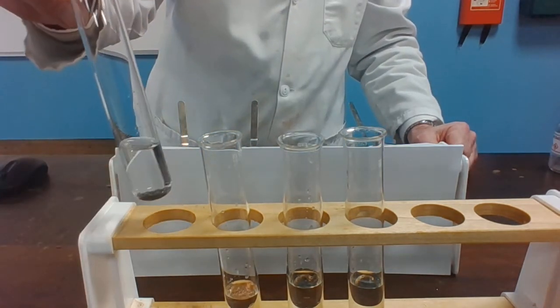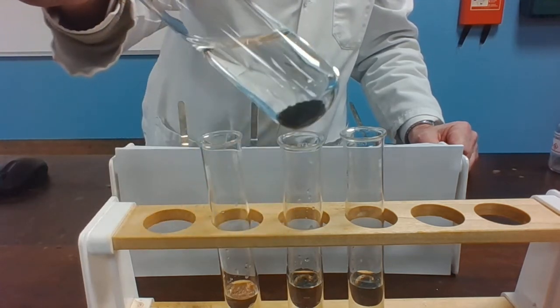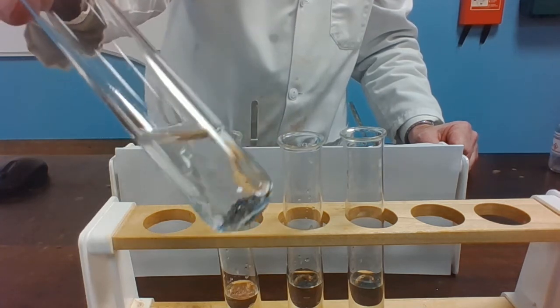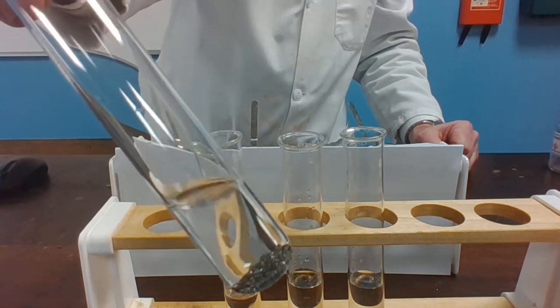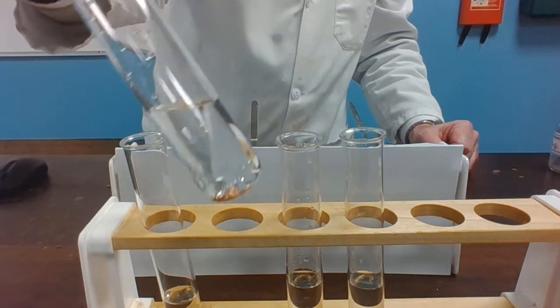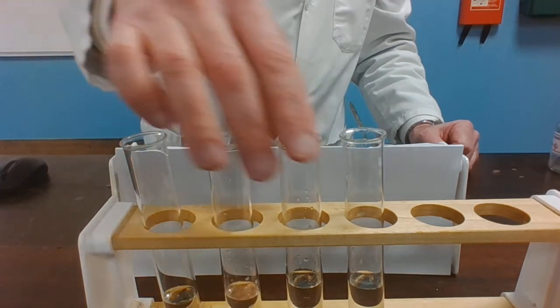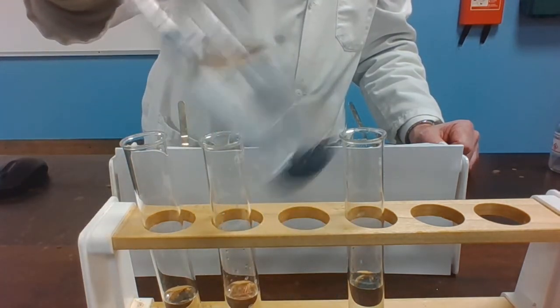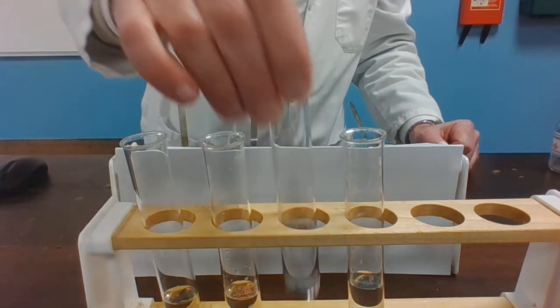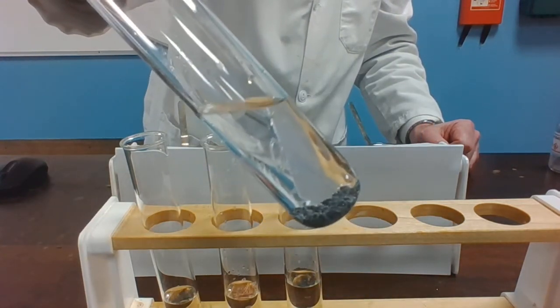We're looking for any evidence that the initial metal has displaced lead — lead is a sort of silvery-gray metal. It's hard to distinguish between some of the other metals we've added. Is there any evidence with the iron that lead is forming in that tube? Is there any evidence that lead is forming now we've added the copper? Is there any evidence with the zinc granules? And finally, is there any evidence that lead has been produced there with the magnesium?